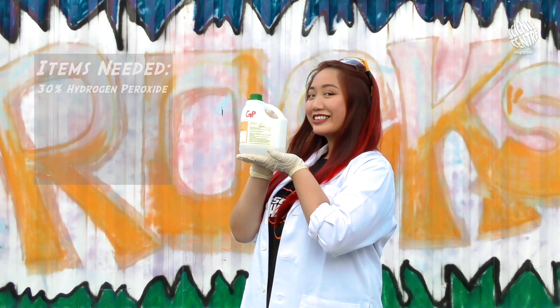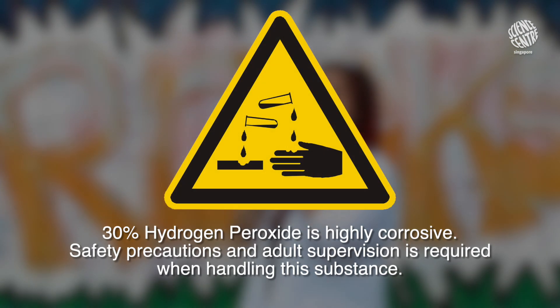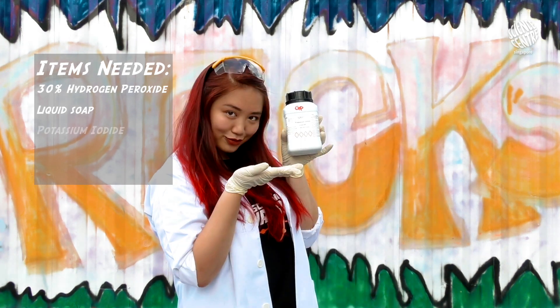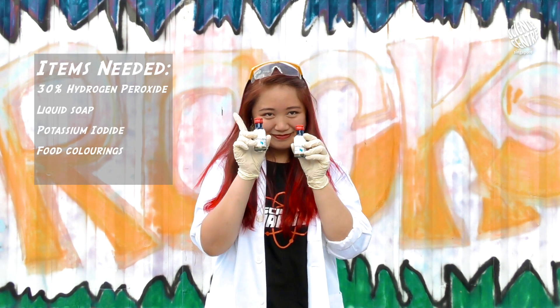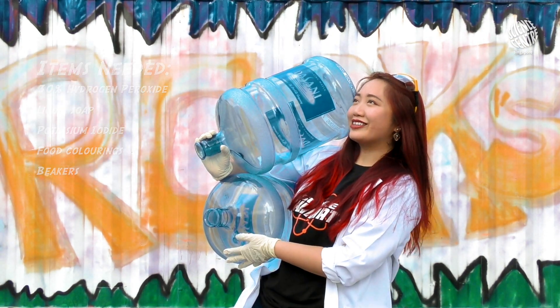Here's what you need: 30% hydrogen peroxide, liquid soap, potassium iodide, two food colorings of your choice, and last but not least, two large beakers to dump everything into.